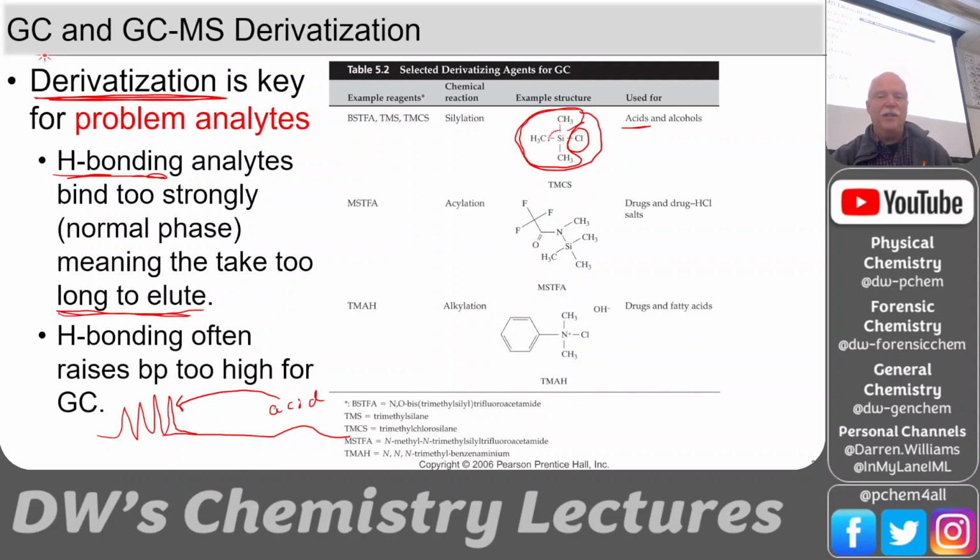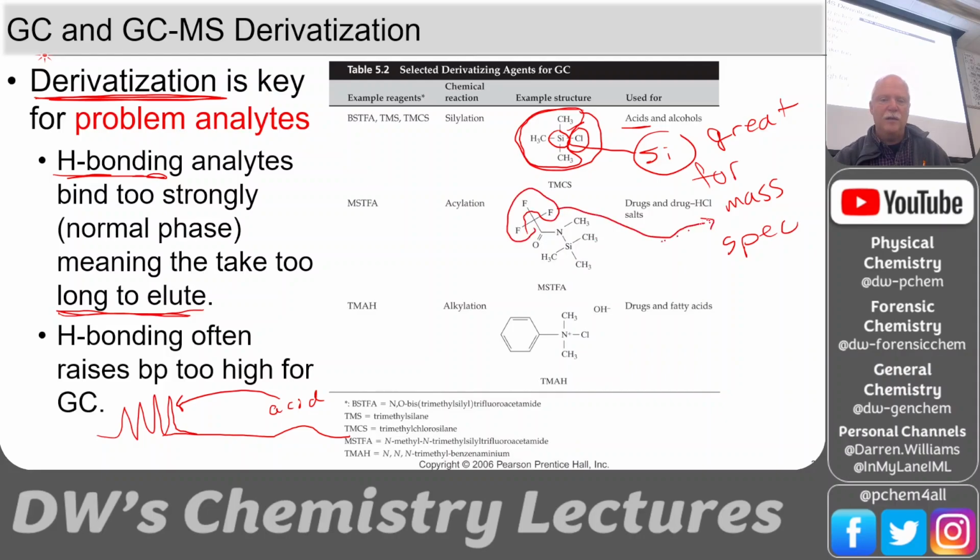Another great thing too is you've added a silicon. That's great for mass spec. Okay, here you've added fluorines. Also great for mass spec.